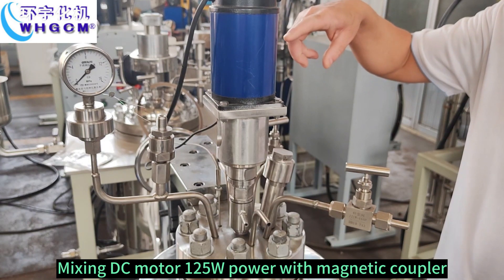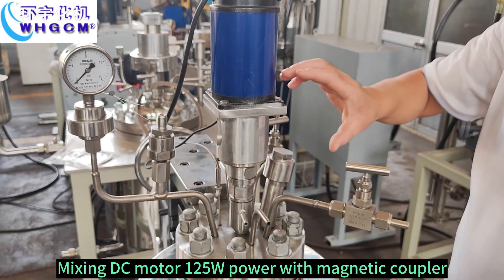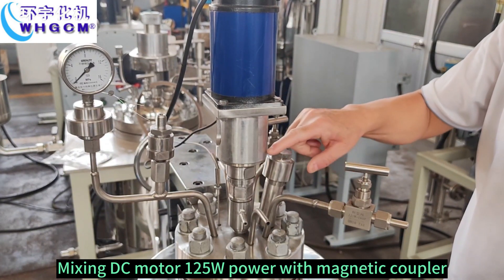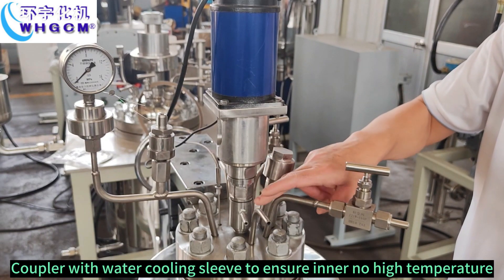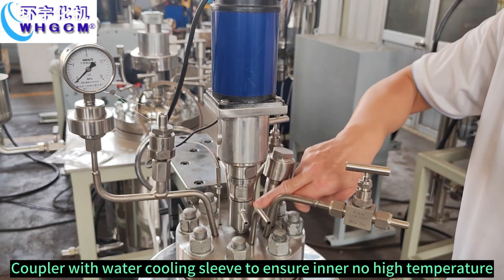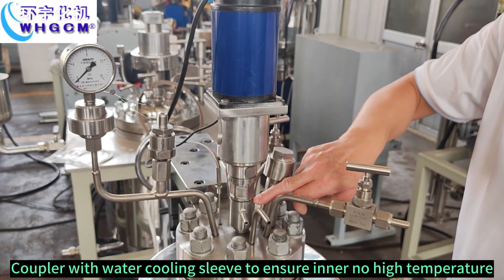Mixing DC motor 125W in power with magnetic coupler. Coupler with water cooling sleeve to ensure inner no high temperature.